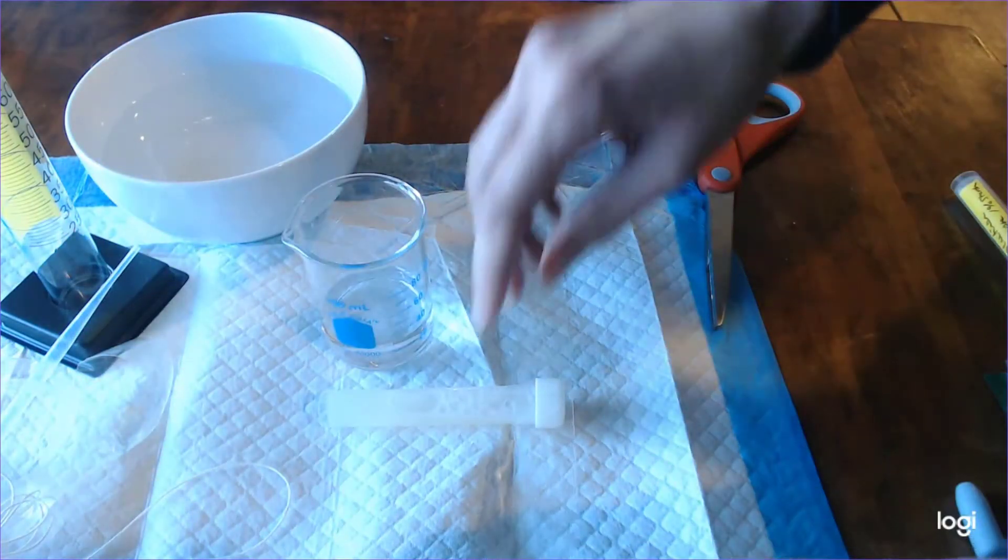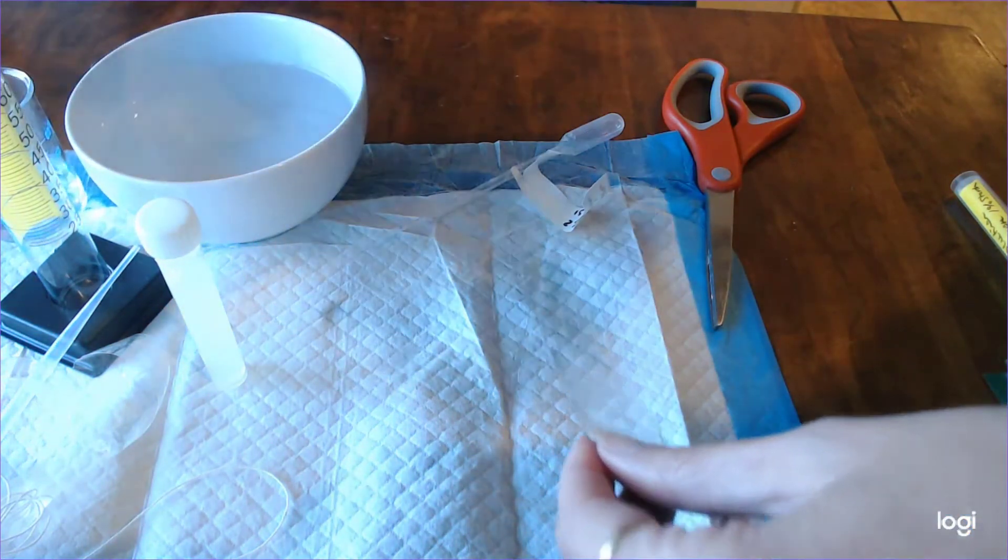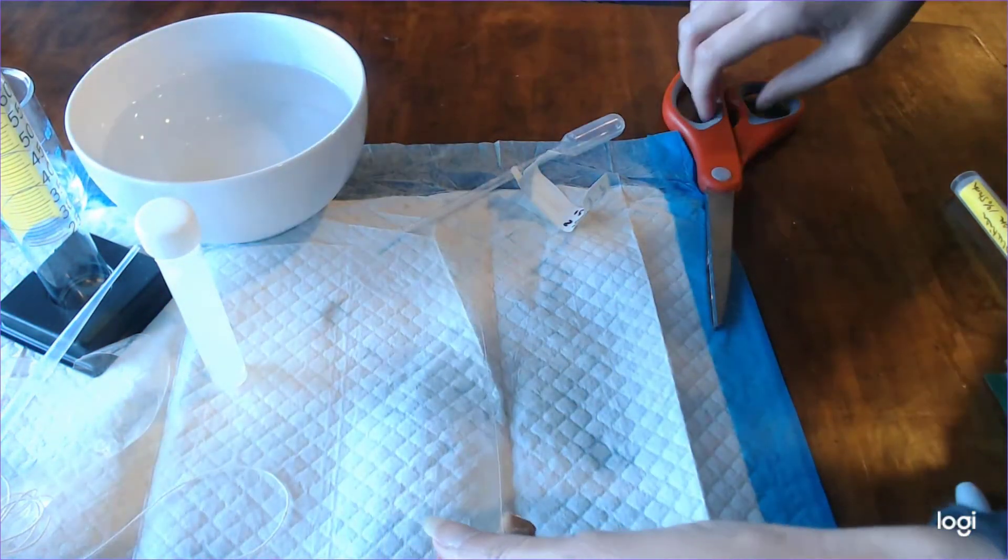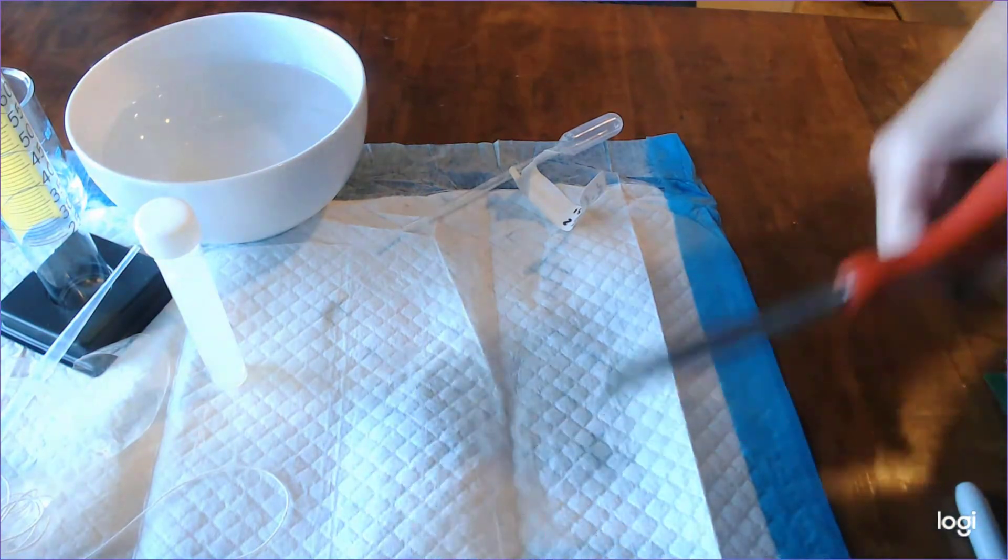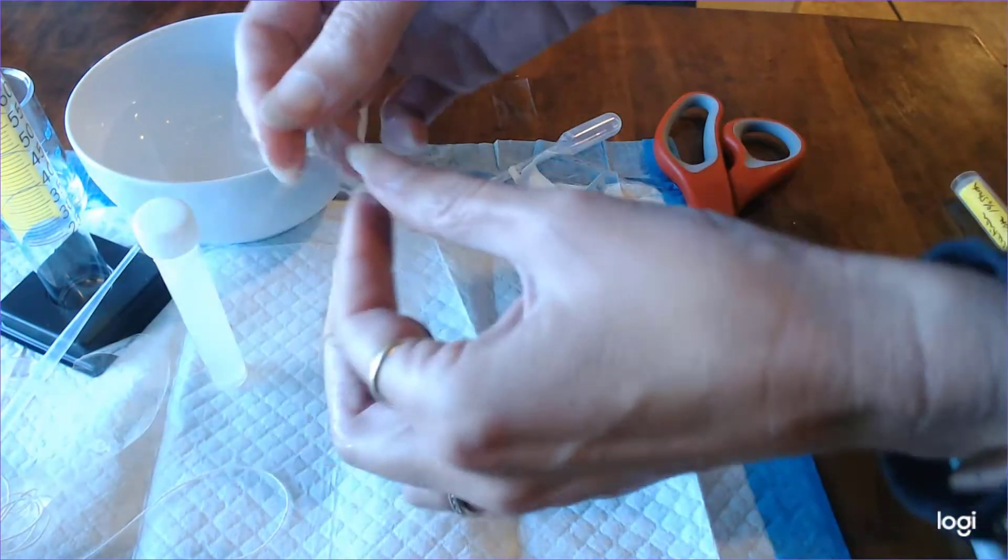So now we're going to go ahead and return to our dialysis tubing which has been soaking for about 15 minutes and I cut an eight inch strip off but I really only need about six inches so I'm just going to cut a little bit more off here. You can keep eight inches if you'd like to start with, you'll be cutting it down later anyway.